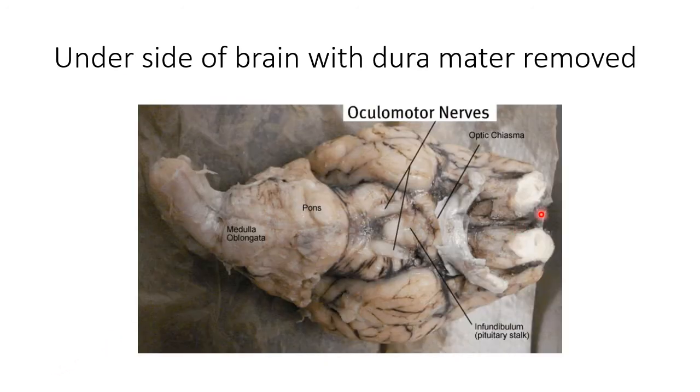Someone has dissected the dura mater off the bottom part of this brain and done a very, very good job on it. So now we have our olfactory bulbs. Think about a stinky olfactory — the olfactory is for your sense of smell. Olfactory bulb, olfactory tract, and these have sensors directly in the dorsal aspect of your nose.